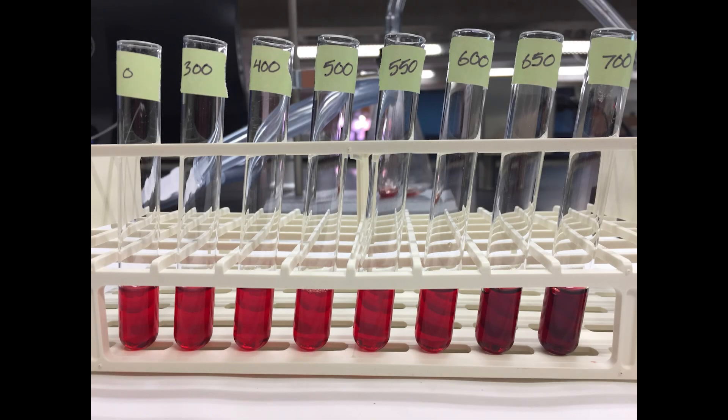Once you've finished all the vacuum pressures, your tubes should look something like this. You can see that the hemolysate gets darker as it becomes more deoxygenated under higher vacuum pressures.